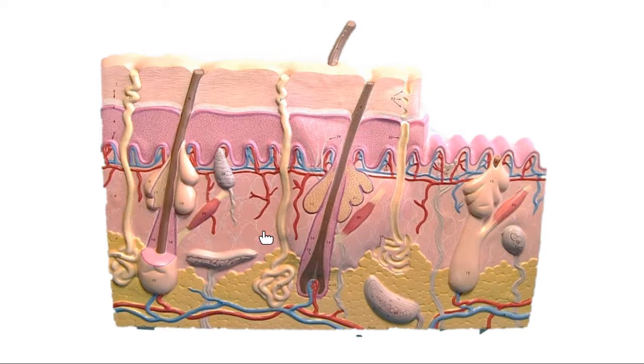So let's start by talking about these big dark things right here. These big dark things that we're looking at right here, does anyone happen to know what these are representing for us? Let's start with these. Draw some lines together. Yeah, so these are hairs, right? We've got multiple hairs embedded in this skin in our picture here. So when we talk about hairs, there are two parts to them for you to be familiar with.